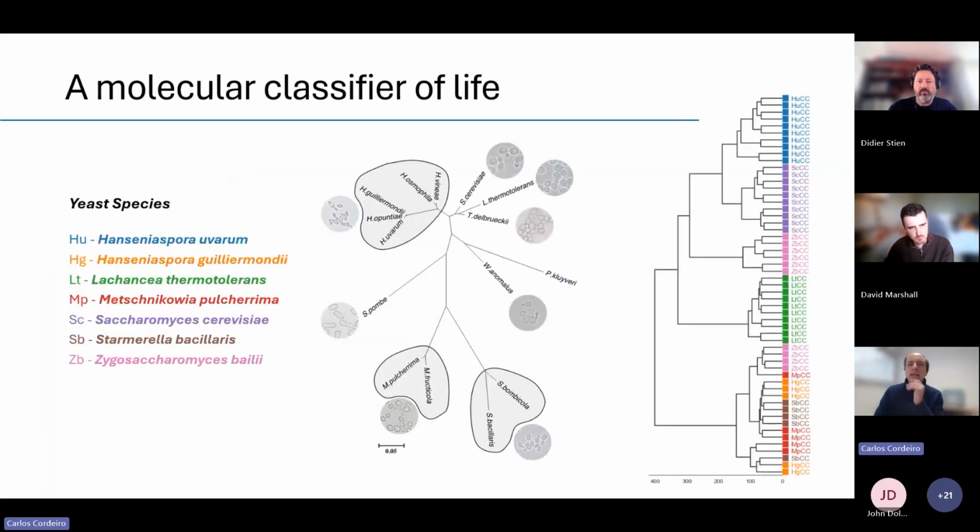For example, what you have here is metabolic classification of different yeast species. And this would be a typical phylogenetic tree based on genetic information. And of course, if you look just at the metabolism, you can see that they're clearly separated. Of course, they are separated in a different way than you get from genomic information, but all in all, this is a very accurate technique for identification.